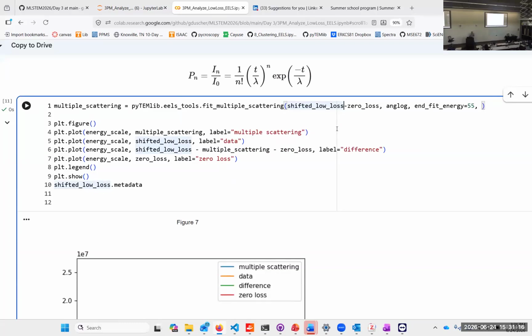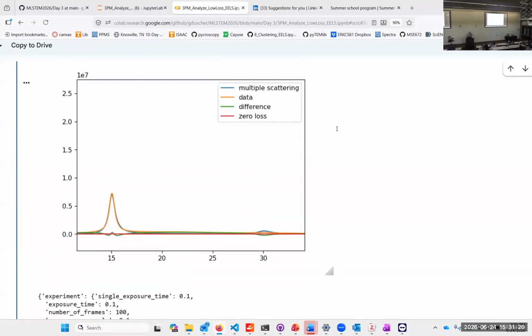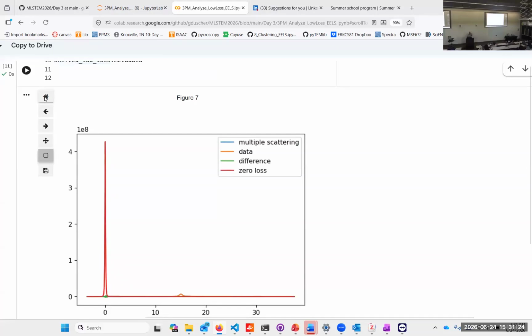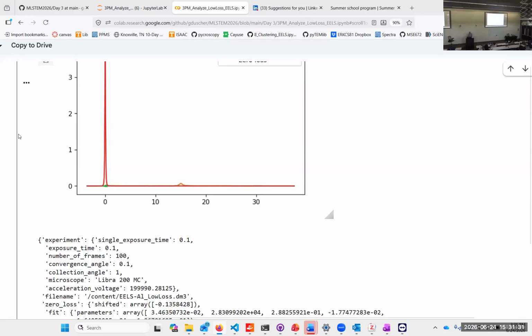And now we covered the main parts of this spectrum and have that characterized. So the zero loss peak, and we have the plasmon peak. The main point is this plasmon peak does not give us much information, especially not when it's related with multiple scattering and so on.